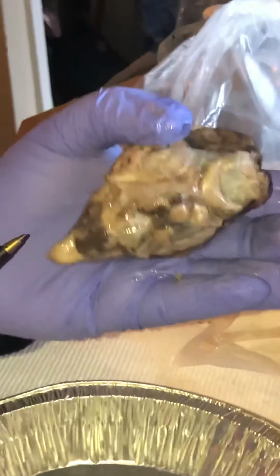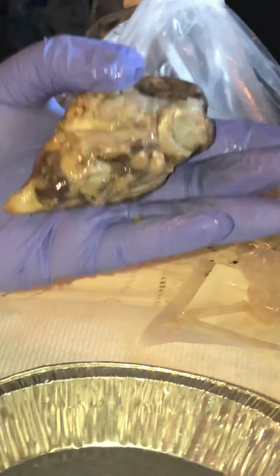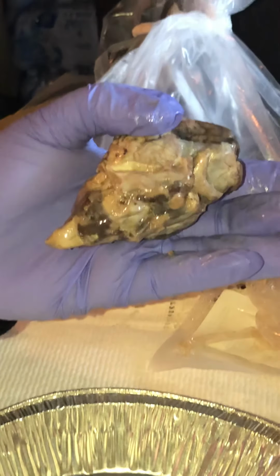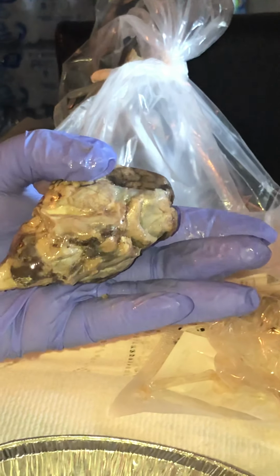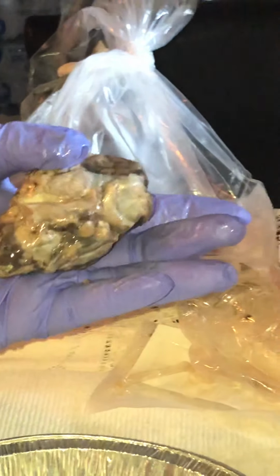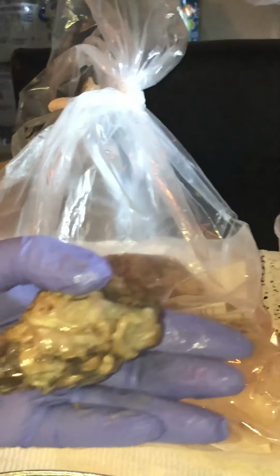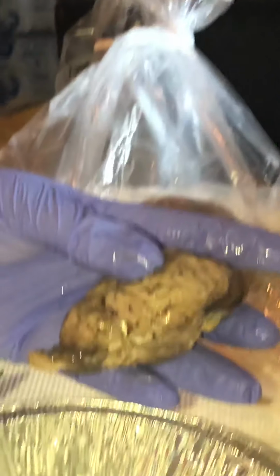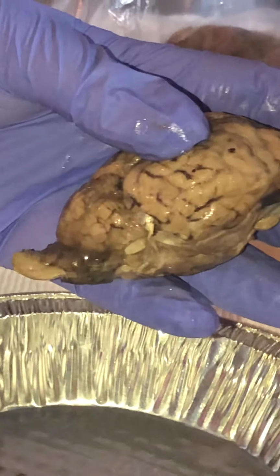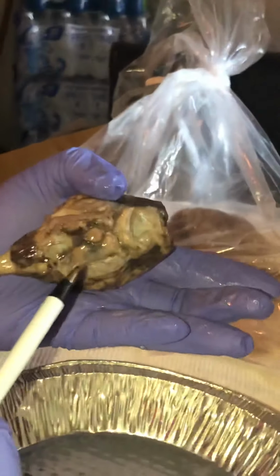So we have the brain stem right here, and for the brain stem, we're going to do the medulla and the pons. Okay. So we have the pons.